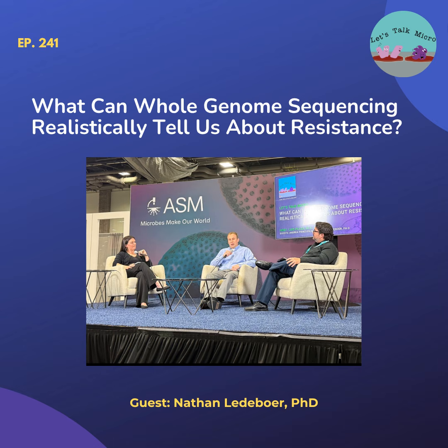So we're going to have to be comfortable with the depth of sequencing to make sure that we are adequately able to separate that as well. So there are both technological challenges that we're going to have to overcome, as well as software or analysis challenges that we're going to have to overcome as we start to use this more and more, especially as we go into the resistance determination or the detecting resistance space.